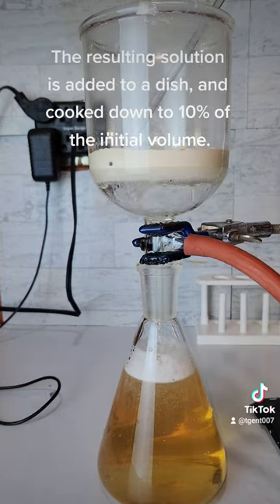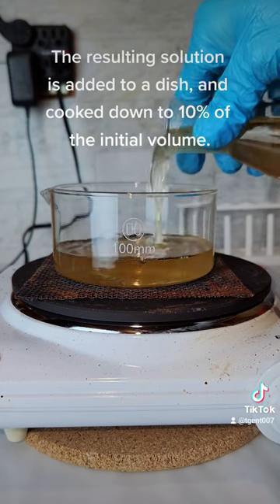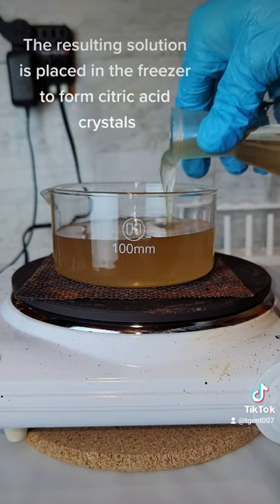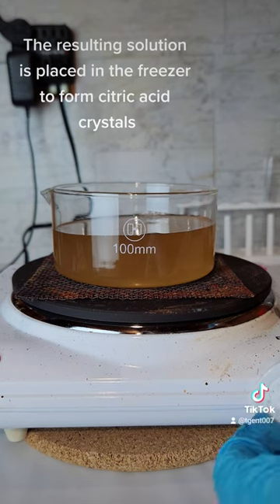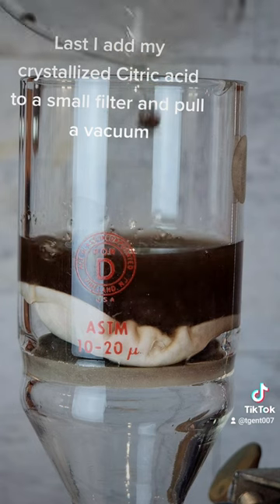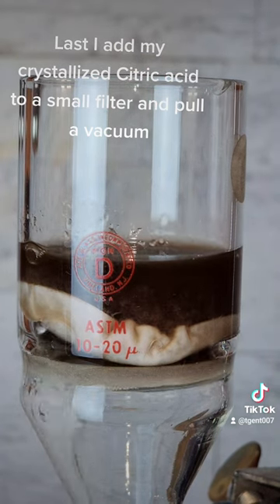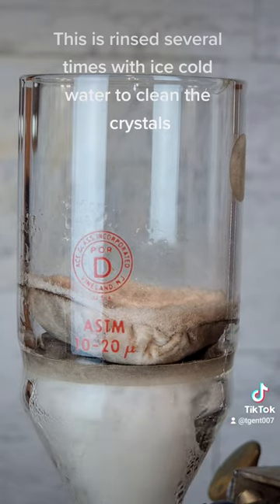The resulting solution is added to a dish and cooked down to 10% of the initial volume. The resulting solution is placed in the freezer to form citric acid crystals. Last, I add my crystallized citric acid to a small filter and pull a vacuum.